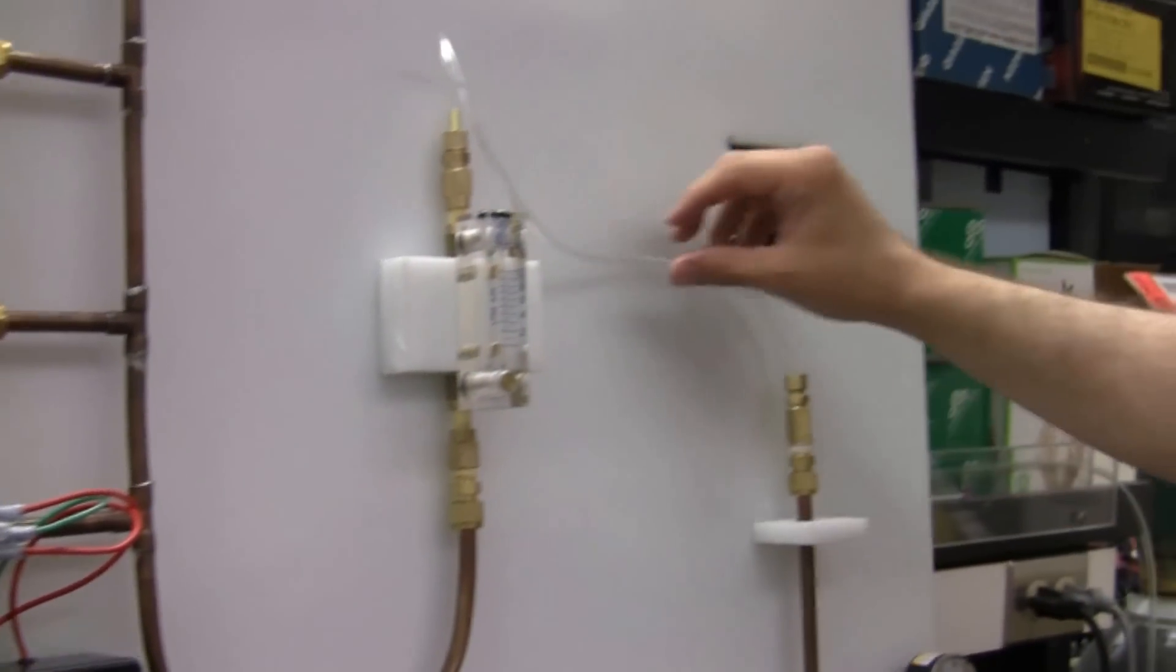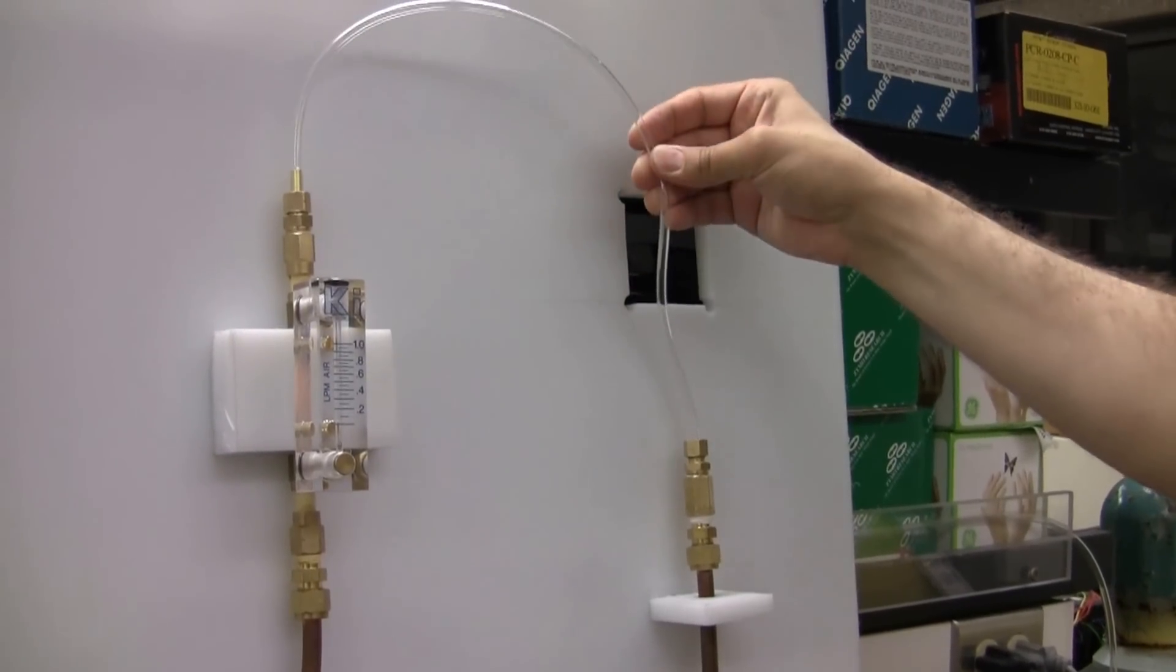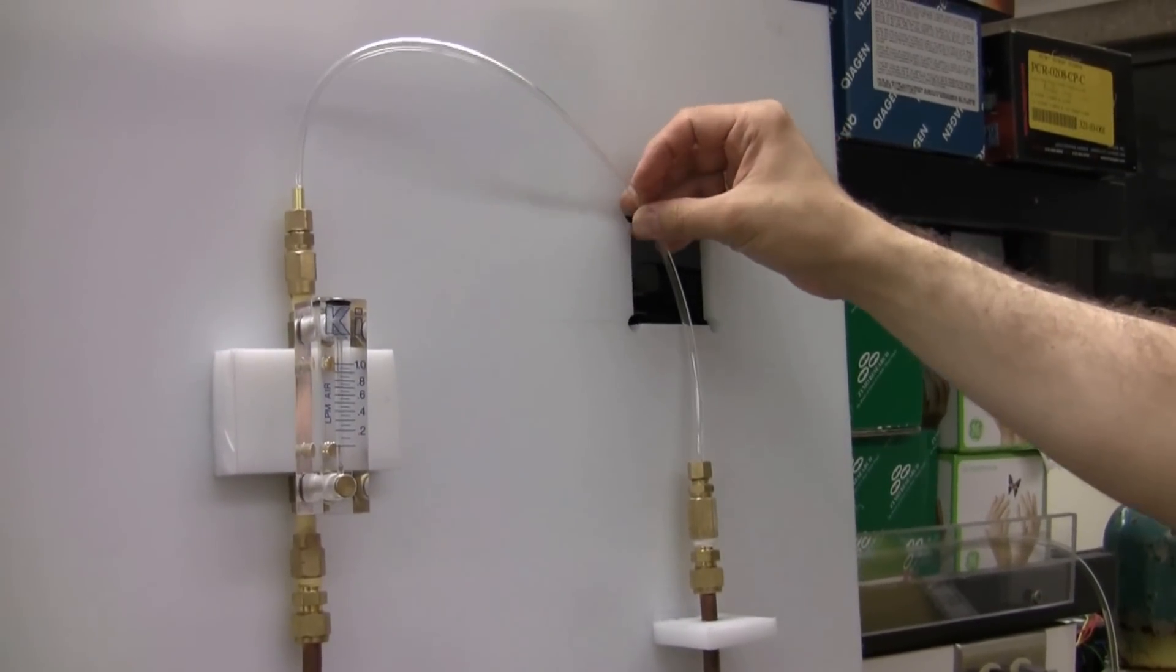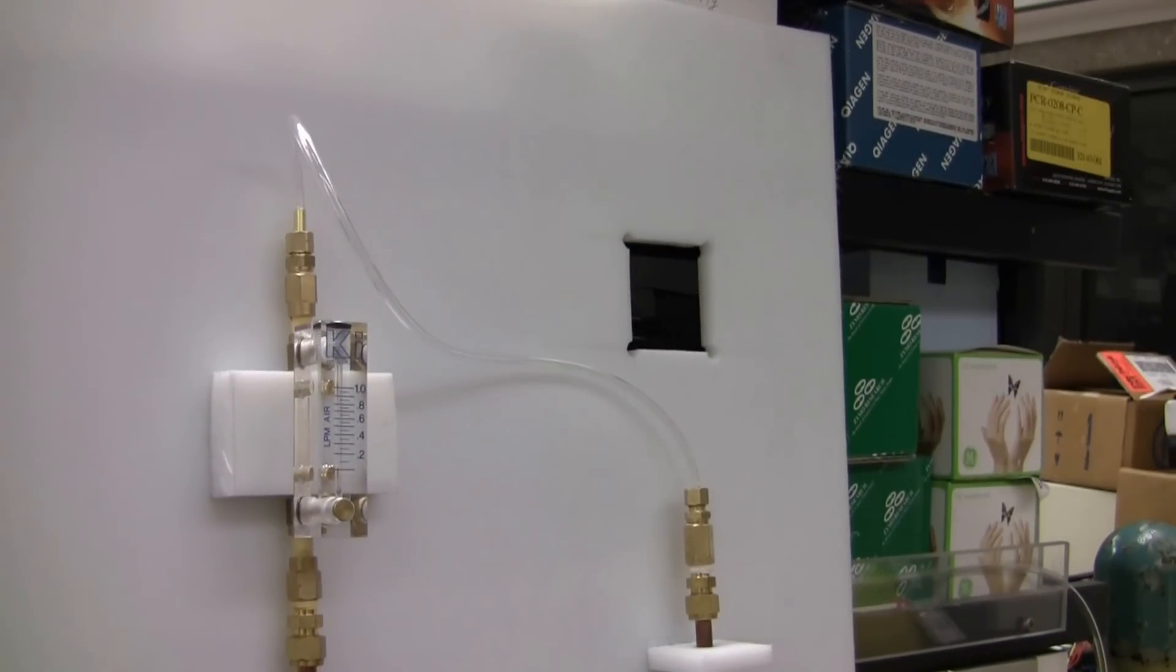Here is one thing which may look strange, is that piece of hose. That piece of hose is a proxy for the oxysorb. The oxysorb, you will see it on the final picture.